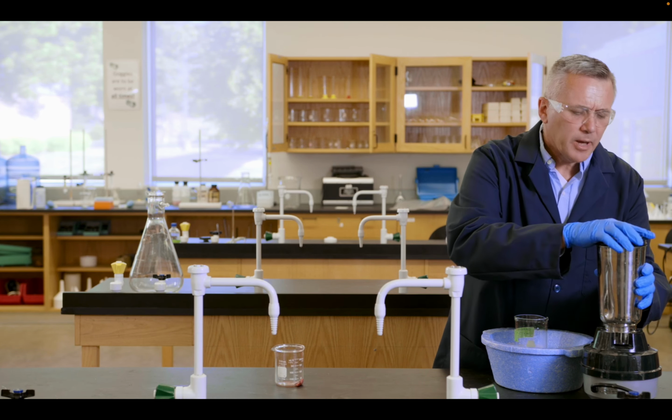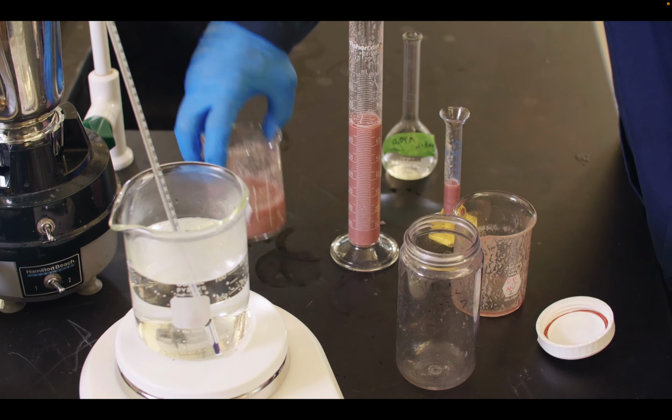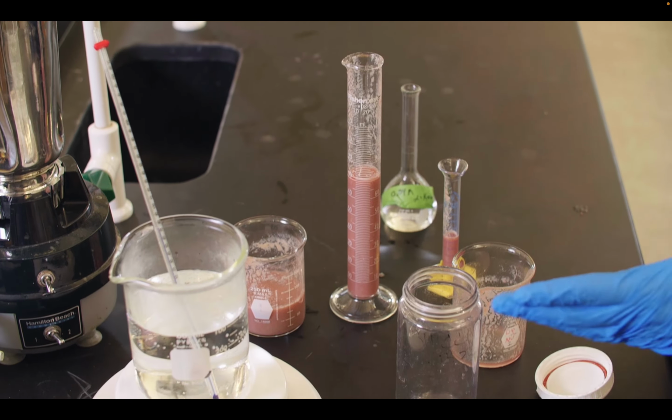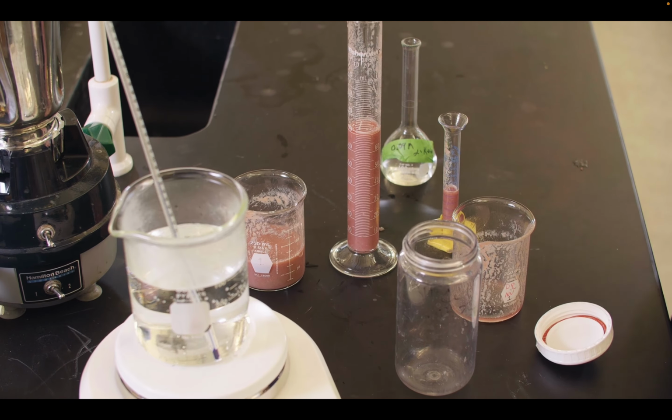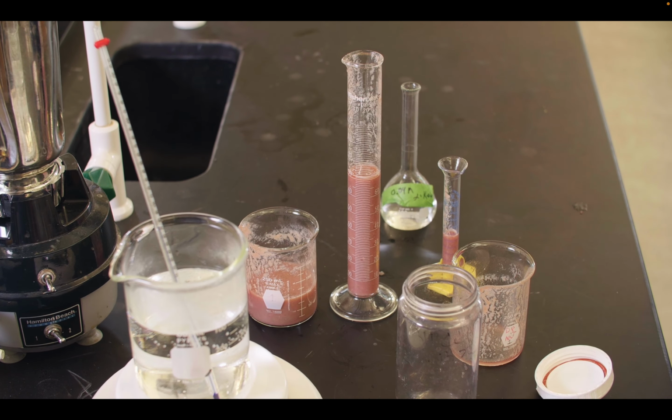So I think we're blended up, and we'll be back in just a second to show you some of the blended material. All right, so we're back. So we blended up pig heart, and it looks like this, maybe a little bit like a tomato smoothie or something. We measured out exactly 75 milliliters of what we blended up, and that's going to be our fraction 1. So FR1 is fraction 1, and that's going to be a total of 75 milliliters.